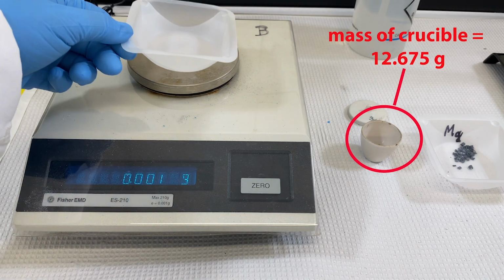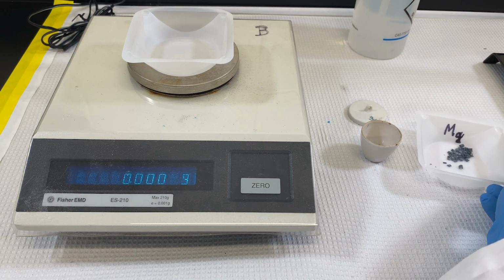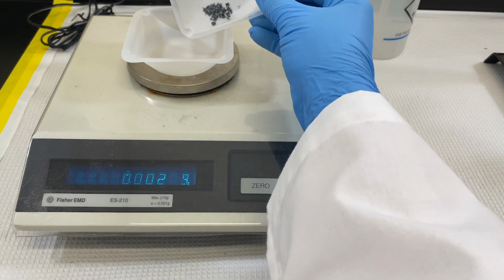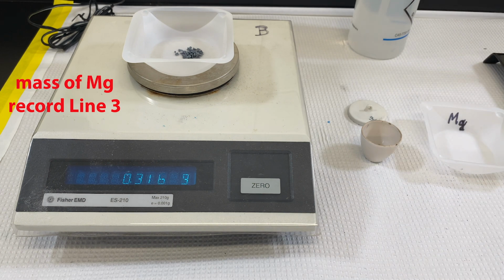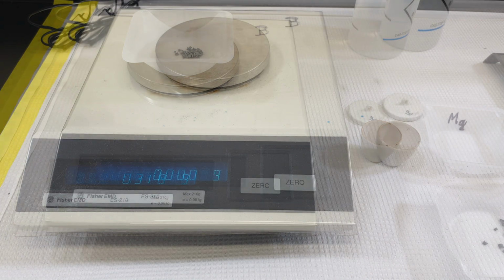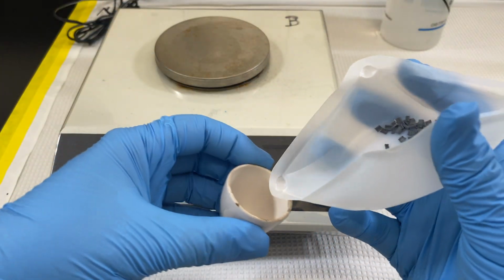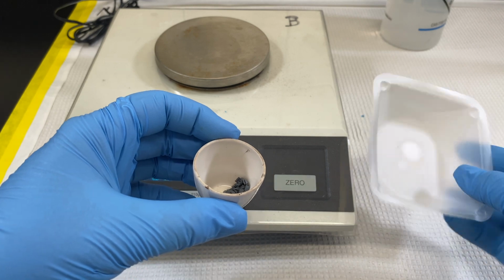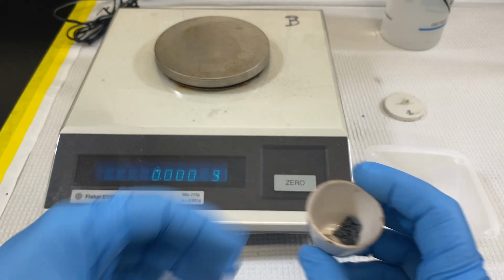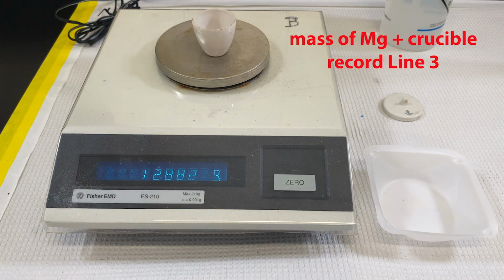The crucible has been pre-weighed. Now to determine the amount of our reactant, magnesium metal, that we're going to use. And just in case we need it, let's go ahead and record the weight of the crucible plus the magnesium metal.